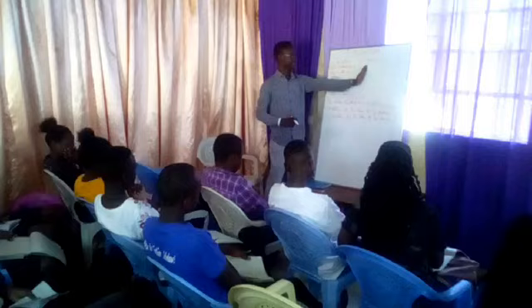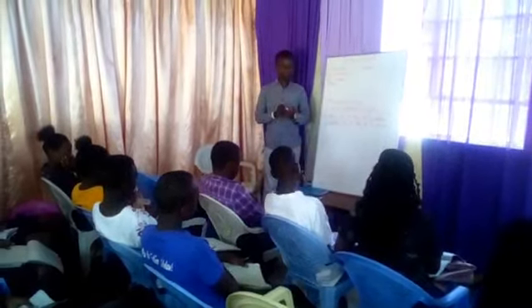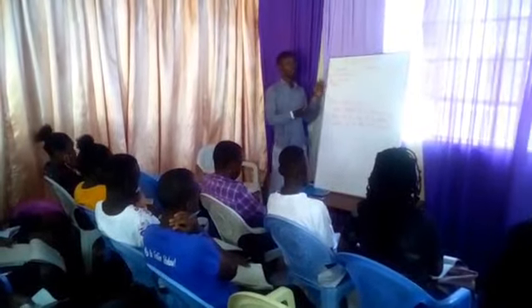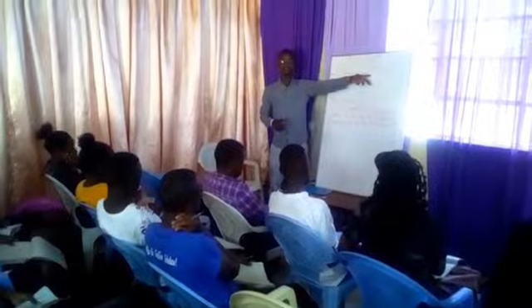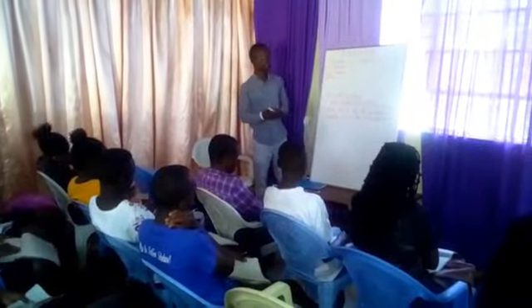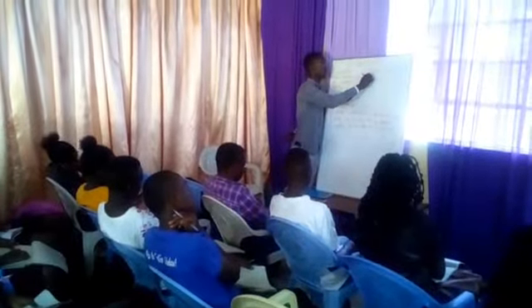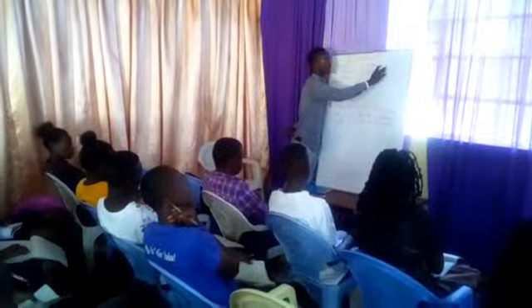You come to your inference. Now, when writing inferences on this side, if you have written one observation here, you must also have one inference on this side. So your inference will look like C dissolves. Then you say a soluble salt. Soluble salt.